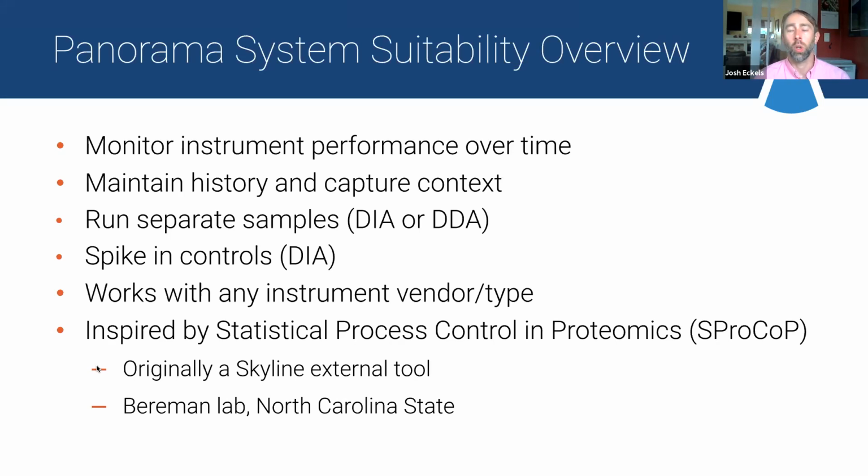But really, we're looking to monitor performance of the instrument and the whole system over time and capture that whole history. And if we can, some additional context so that if we see a particular problem recur, we can much more quickly diagnose and address it without having to reinvent the whole process.